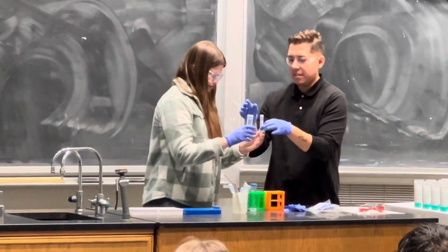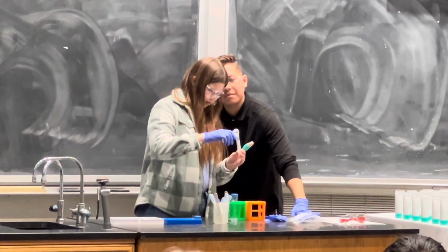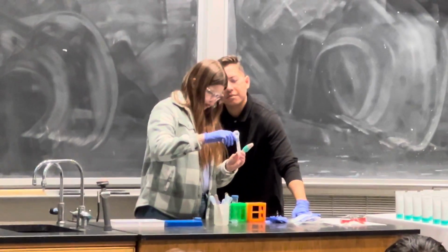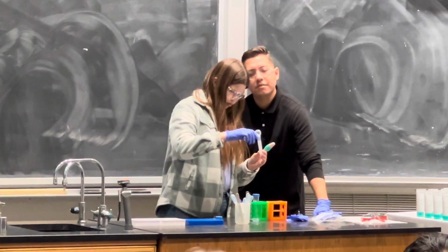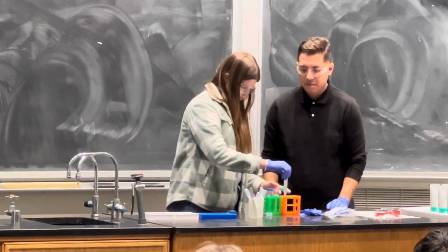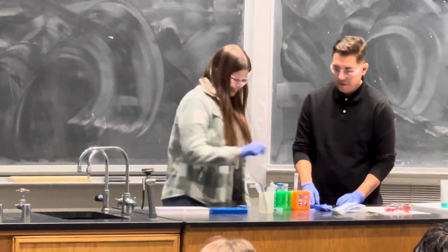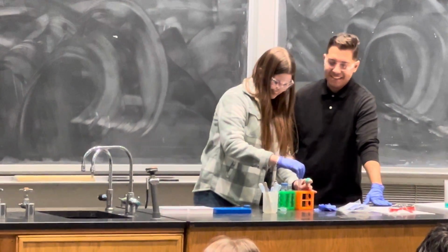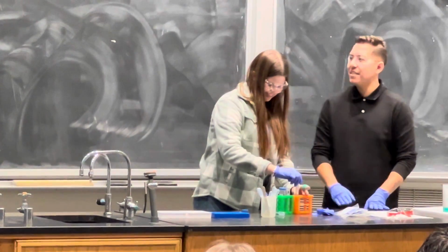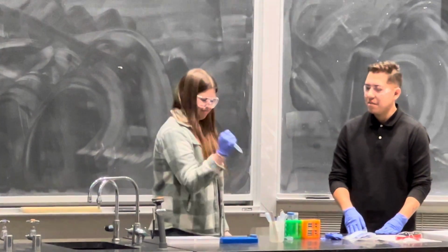It's easier that way. Yeah, and then you're just going to cap it and shake it up. That's a good analytical chemist right there. She's looking to make sure she filled it to the right mark. You're hired.